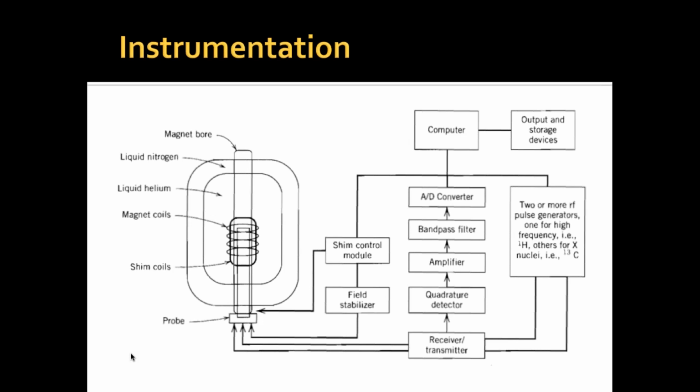So we need a high frequency to do all the characterizations and to use NMR in all the applications. Not only in organic molecules, NMR is useful in biologically active molecules as well as in DNA, RNA, proteins, etc.